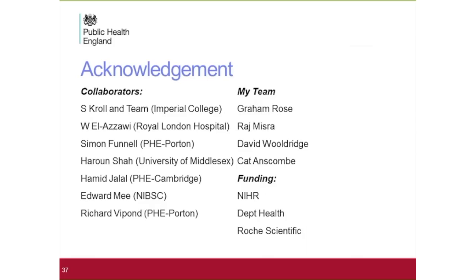Well, the percentage of phages in the microbiome has been a bit of a challenge. It's one of the areas we are working on at the moment, to see if we can extract the phage component. Until now, our results indicate that it's an insignificant number against the total reads using the current lysis methodology. So it would be good to hear from others who have worked on phages of what observations they had and which groups of phages they have been able to successfully analyze and isolate.